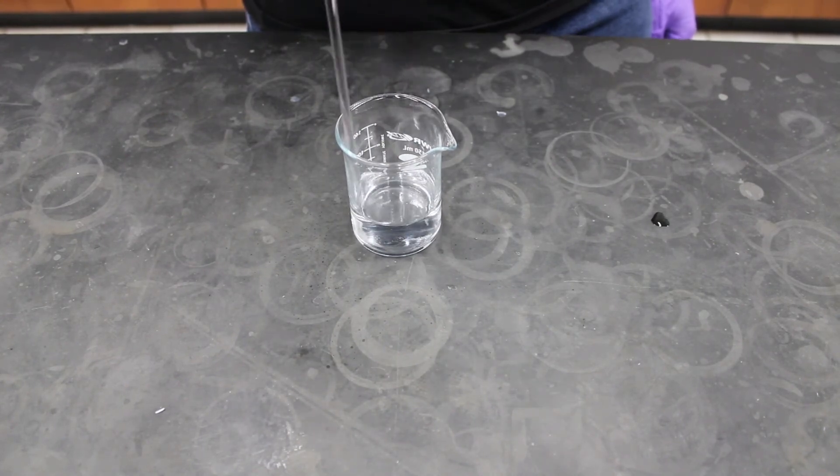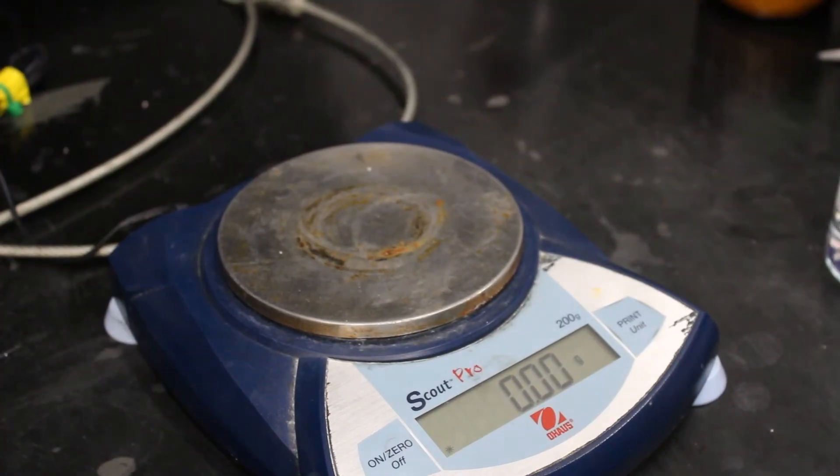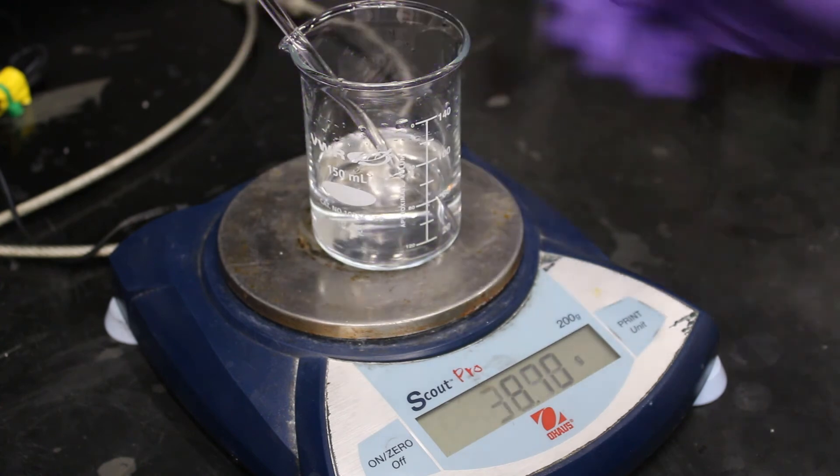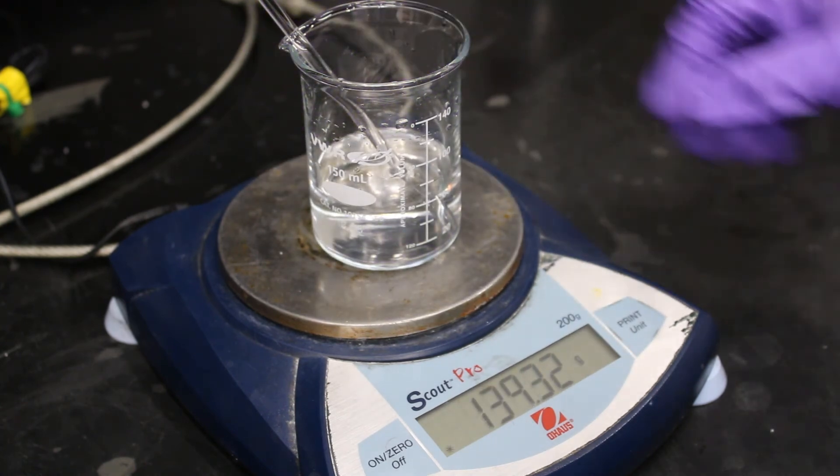Once all bubbles have disappeared and the solution is completely clear, weigh the beaker, solution, and glass rod. Note down the mass in your notebook with the correct number of decimal places in grams.